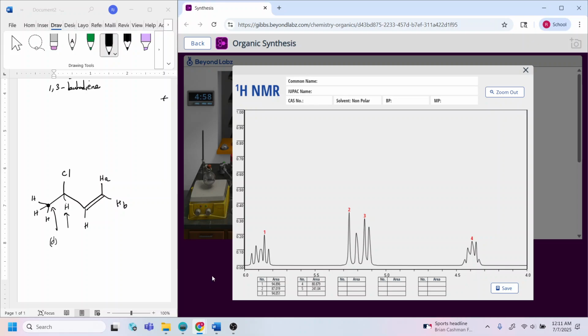So this is the CH stretch. So this CH stretch is around 5.90 parts per million. This is position number 1 because it's going to be the farthest downfield. It's connected to the chlorine. And then after this, it's going to be the farthest downfield. And then we have the hydrogens for the alkene. I'm expecting that CH3 to be upfield.